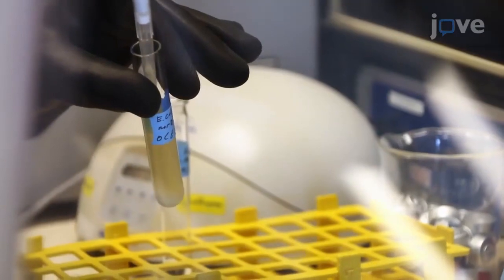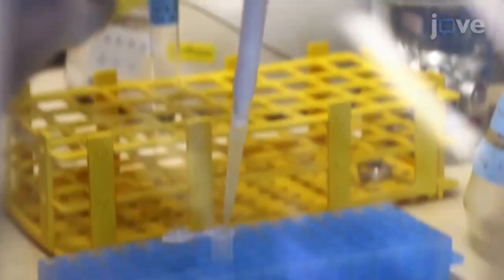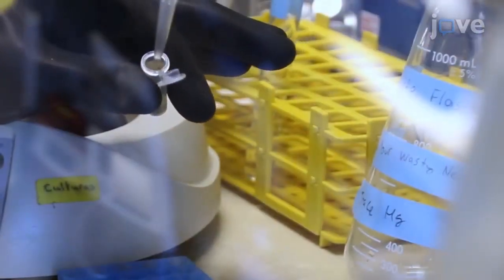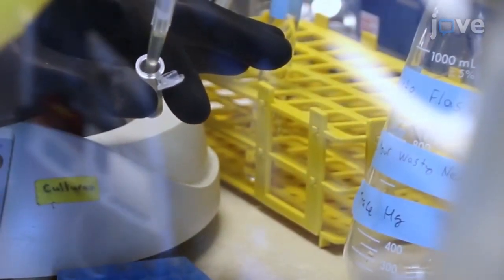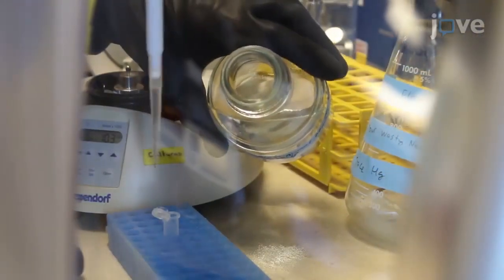Now collect 2 milliliters of the overnight grown culture and transfer into a 2 milliliter microcentrifuge tube. After centrifuging at 10,000 RCF for 90 seconds, remove the supernatant and resuspend in 2 milliliters of fresh growth medium.